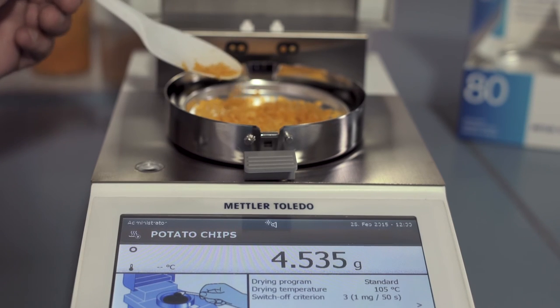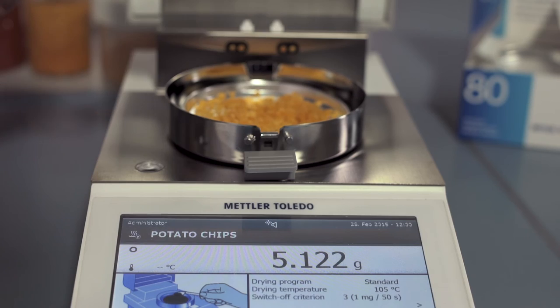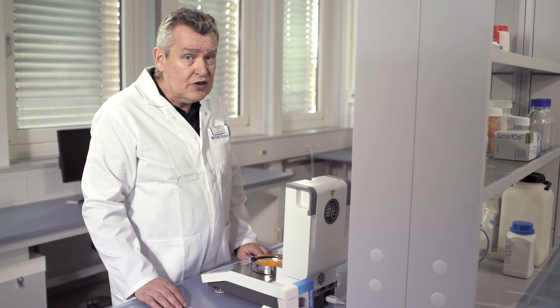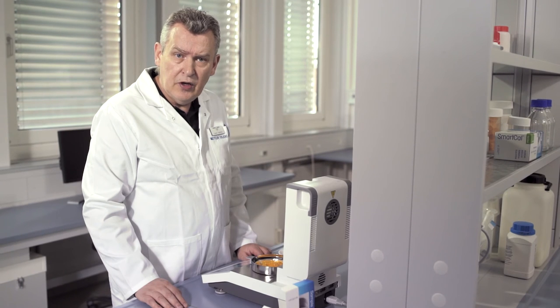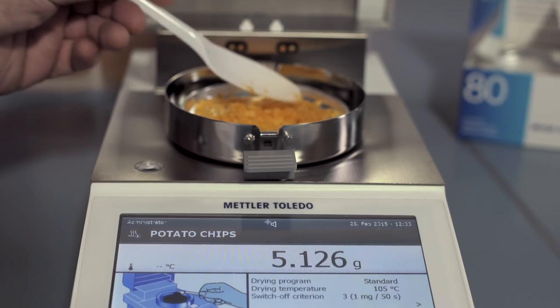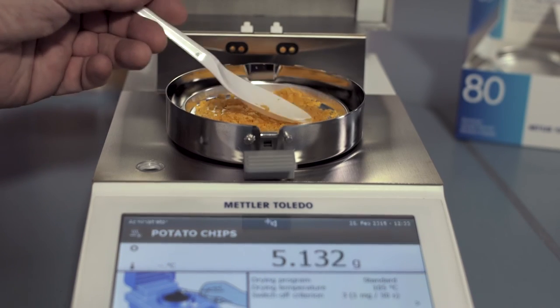Typically, use 3 to 5 grams of sample, but the quantity really depends on the type of sample to be measured. You have to make sure the sample is evenly spread around the aluminium sample pan.